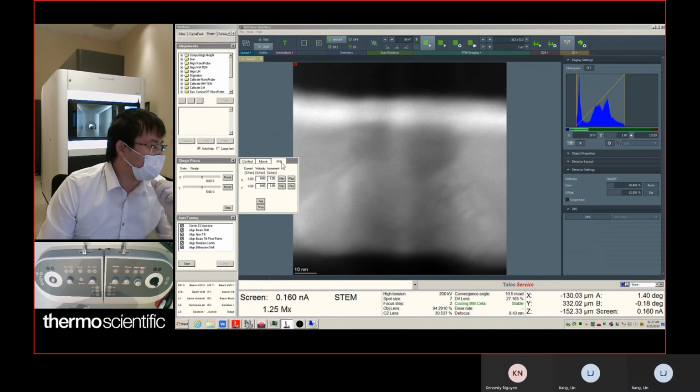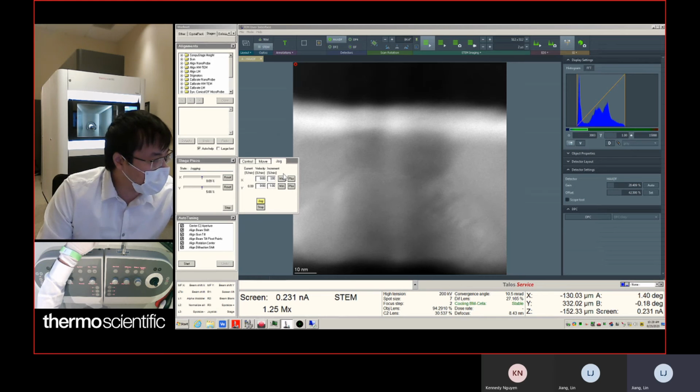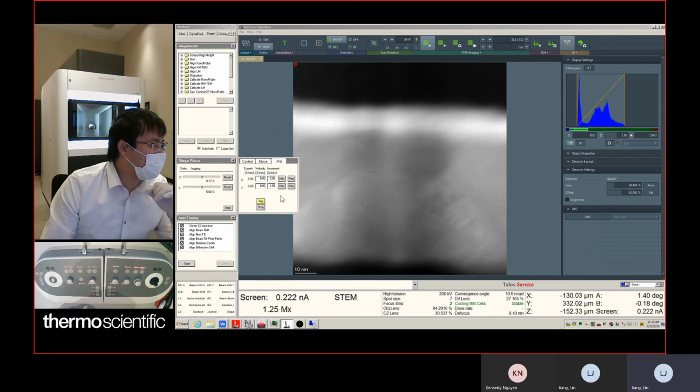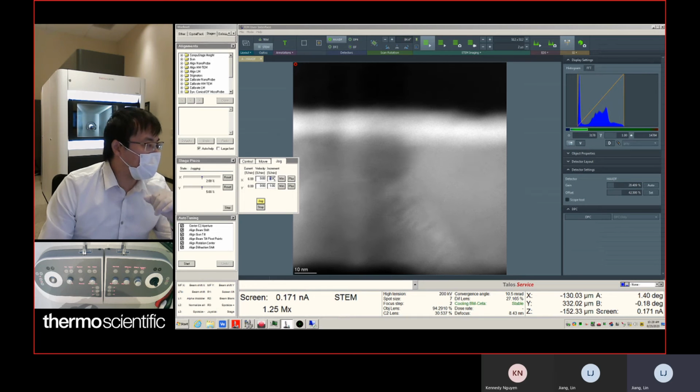Also you can use jog. Jog means you can move the stage in one direction. When you push the jog, you can adjust, let's say, 5%. Okay, it's jogging around the X direction. It moves with a constant change. The change right now is 1.2%. You can select how you increment here. Maybe increase a little bit, right now it's a little bit too slow.